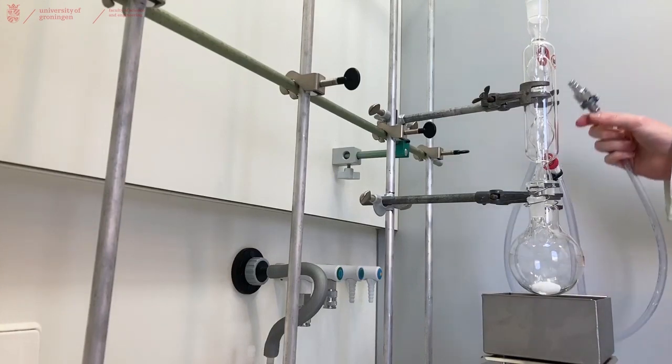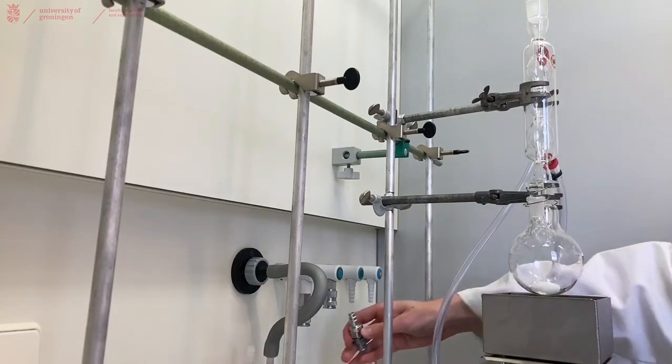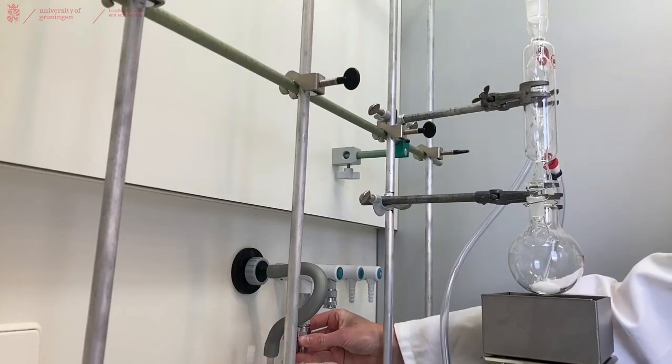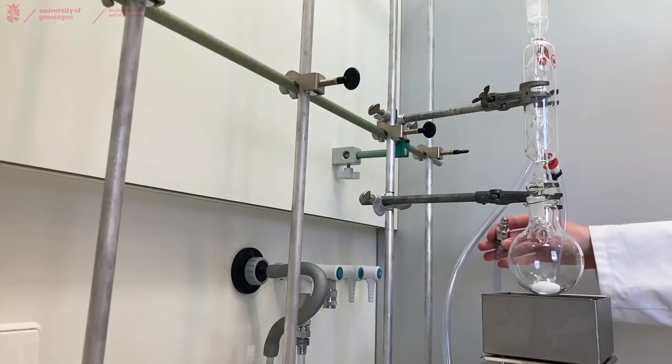Attach the top hose to the water outlet or the sink in your fume hood and attach the bottom hose to the tap or the water inlet in your fume hood.